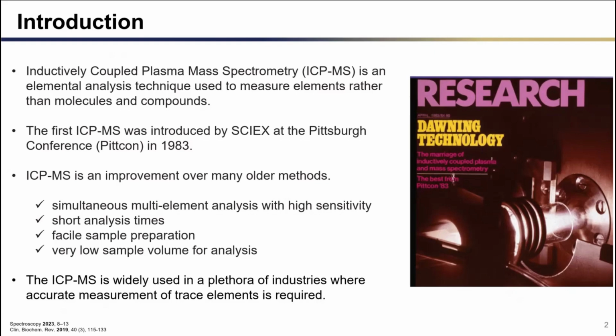The ICP-MS is widely used in many industries where accurate measurement of trace elements is required, such as food, mining, and metals analysis, semiconductor manufacturing, geochemistry, and petrochemicals.